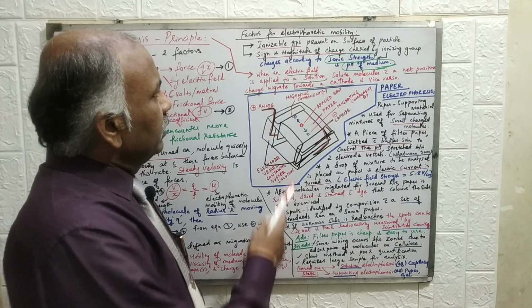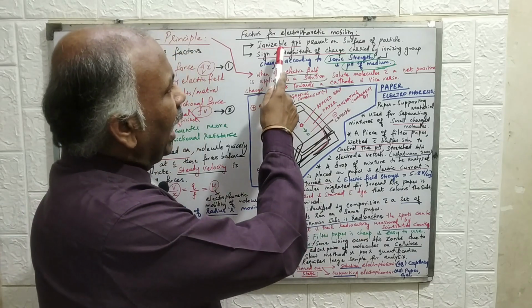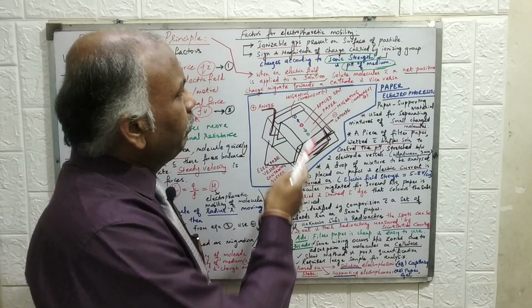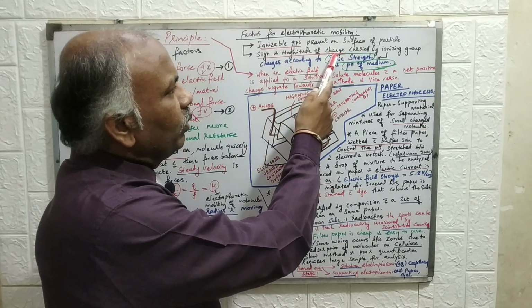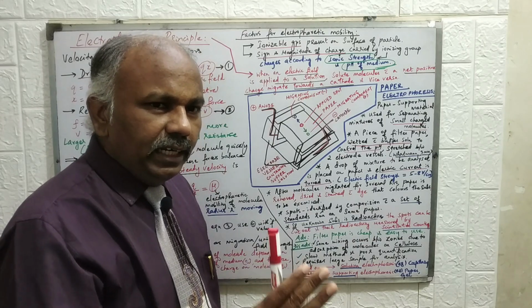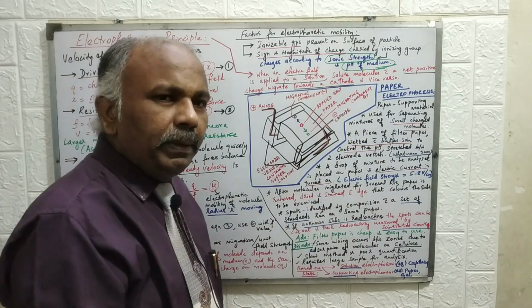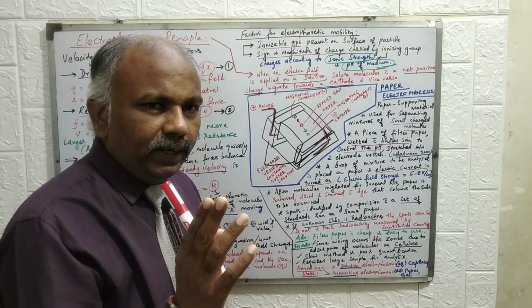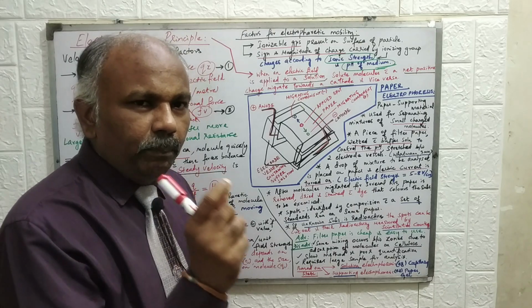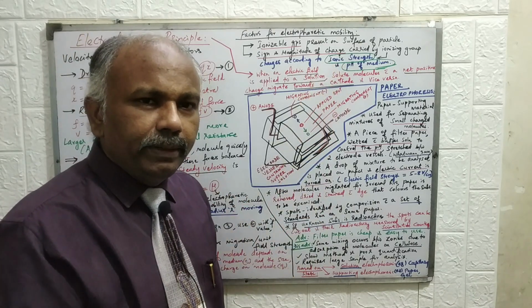Right? There are some other factors also affecting the electrophoretic mobility. One is the ionizable groups present on the surface of the particle, and the second important parameter is the sign and magnitude of the charge carried by the ionizing group. What is the sign and what is the magnitude? That is governed by the ionic strength and the pH of the medium. These are the two important factors.